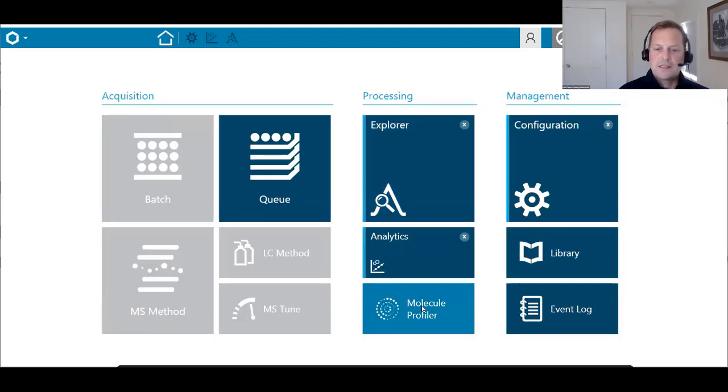I'm not going to discuss this today, but I do want to mention that there have been tools added to it for oligonucleotide analysis, specifically around impurity analysis. So, what I've noticed with some of the 5' capping assays, when you do an RNase digest, sometimes you get, I don't want to call them impurities, but sometimes RNase H provides some other components, like some 3' -1 components. And so Molecule Profiler can automate the identification of those types of impurities. But again, I'm not going to showcase this software in this session.